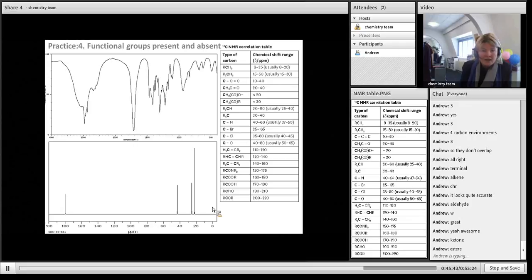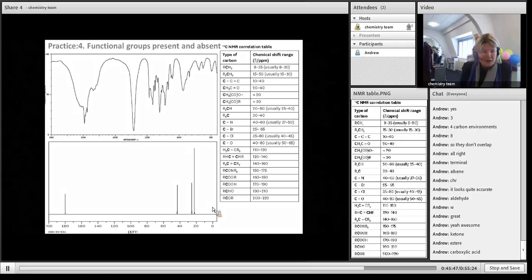Okay, right, what's this one? Hopefully you can see straight away. Carboxylic acid, and you can see it straight away because of the triangular peak. But do systematically look for the 3000, a little bit to the right. There's some alkyl groups. We've definitely got carbons and hydrogens.